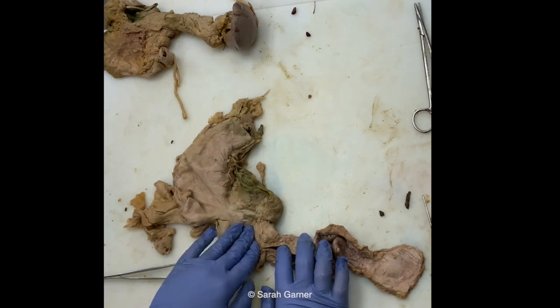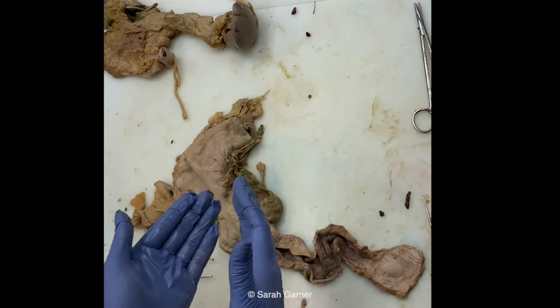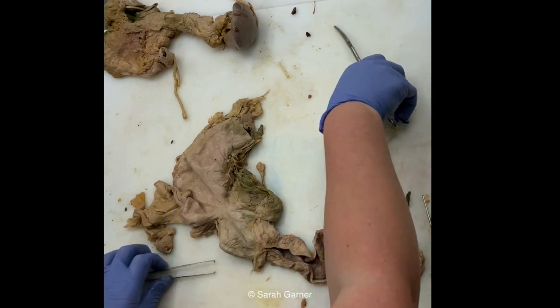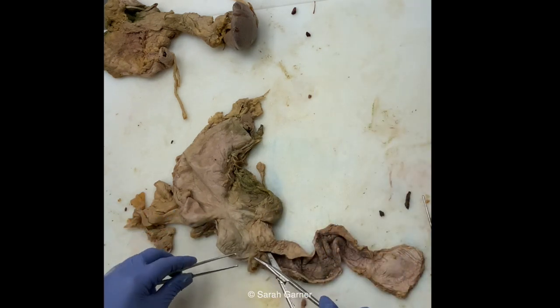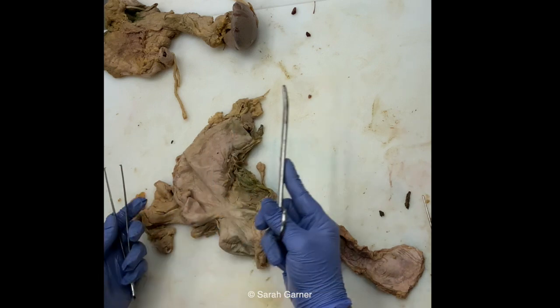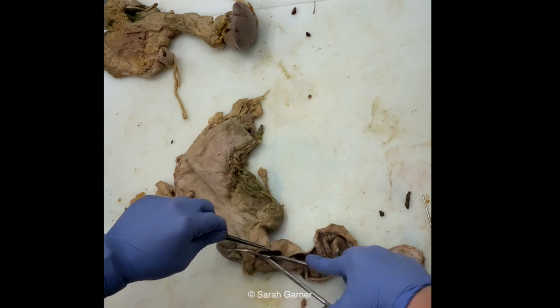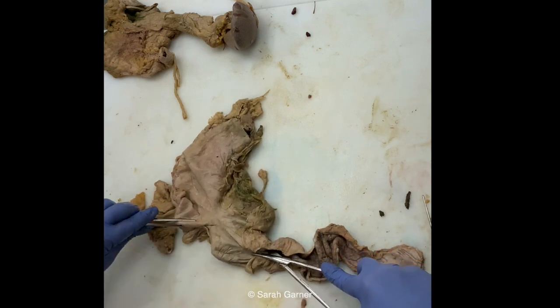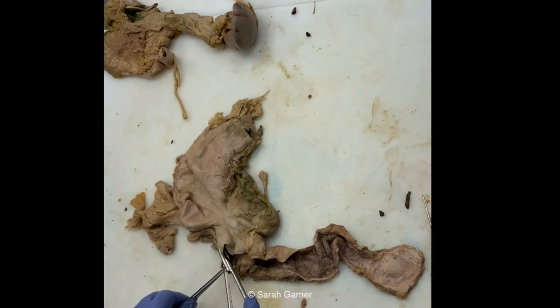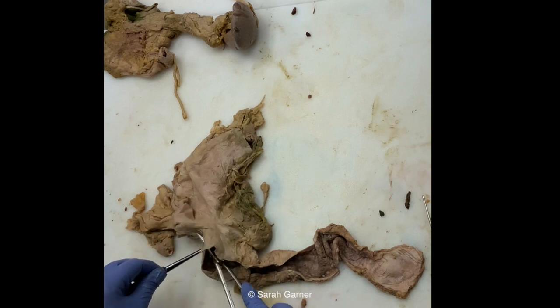do surg path specimens. And so in my opinion, when you're doing an autopsy, it can be really good practice for surg path. So I just tell people to go along the greater curvature to get the practice. Plus you want to keep it oriented, because let's say you cut down the middle and then you find something in there, you may not be able to properly describe where exactly you found it. So I like to just go right along the greater curvature. That way I know what I did, it's very easy to orient, etc.